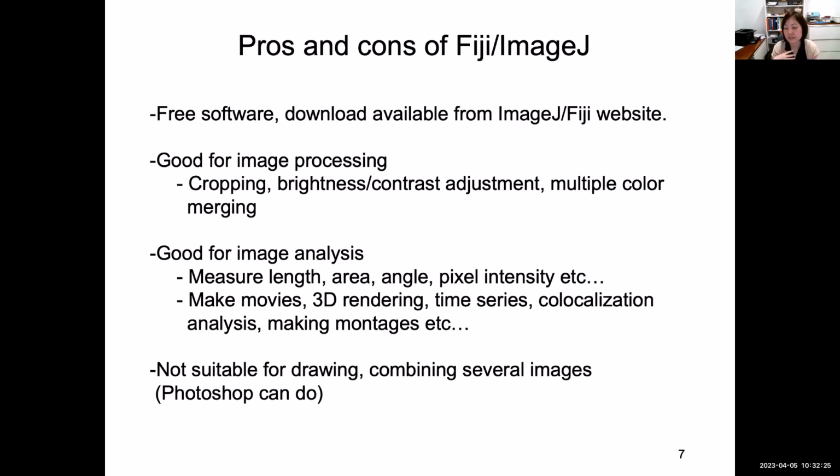when you do the Photoshop, usually each journal has the minimum requirement for the pixel resolutions. For example, for an image file, you have to have at least 300 dpi. Then you have to rescale your images, but you cannot reduce the pixel resolutions. How to do this in Photoshop, I put 1 or 2 slides for that. So please look at those pre-reading materials.